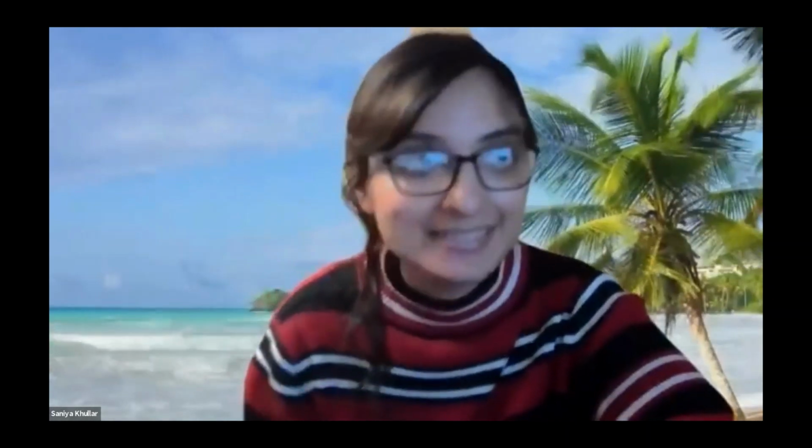So again, guys, that's just how you find the overlaps between two regions, and they don't just have to be a SNP in another region, they can be anything. But I just hope that this was helpful for you guys. So this is the GenomicRanges GRanges package. So I'm just going to quickly show you again the code.